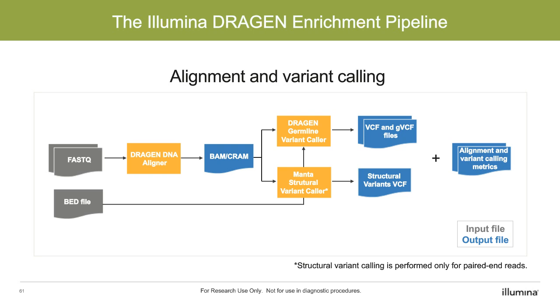One other thing to note here is that we are going to need a bed file, and what this bed file is going to allow for is for the variant calling to be concentrated in the regions indicated. So let's just talk about the bed file for a moment.